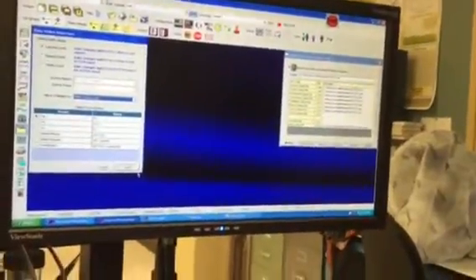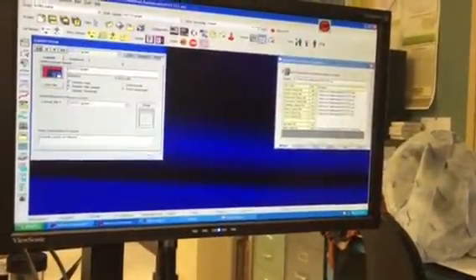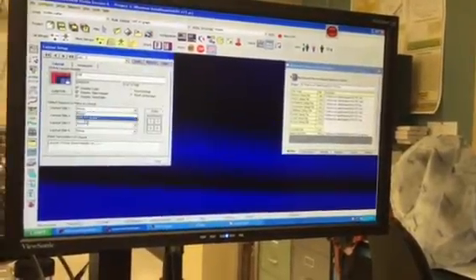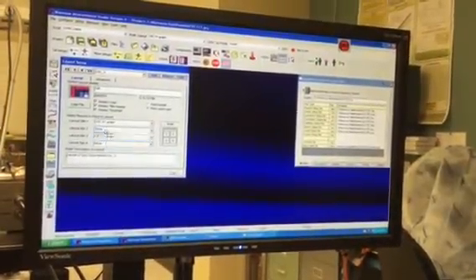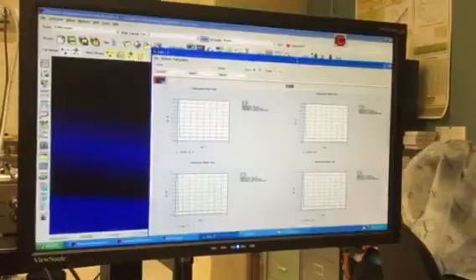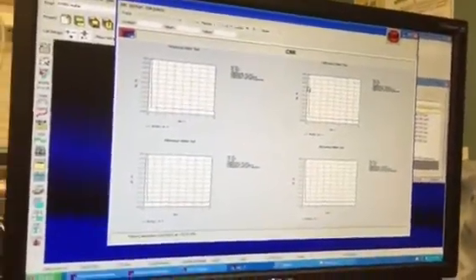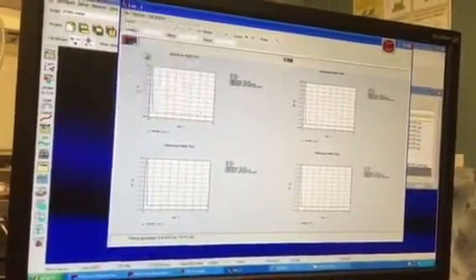And this is an example where you could make something that was a quad. So if you wanted to compare, you can make a layout. Let me add another one. Add a quad. And because I only have the one graph, I'll just put the same graph in all of them again. But so now when we view that, I'll just have it plot all the same ones, but we could have plotted something that had 4 different things in it so that we could see. And then we can say, okay, take that and open Word and show it to me.